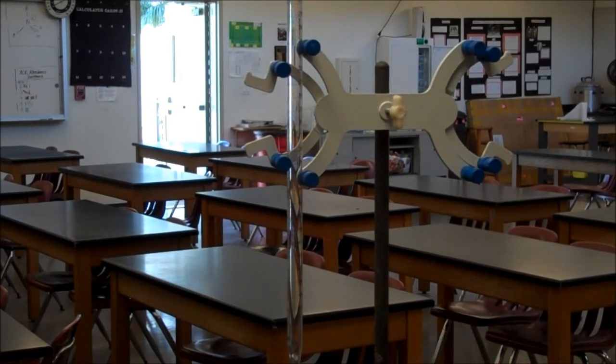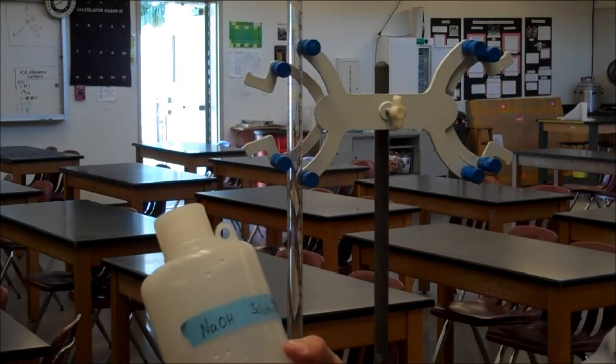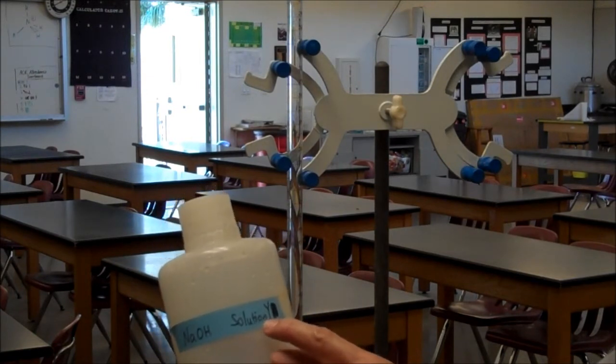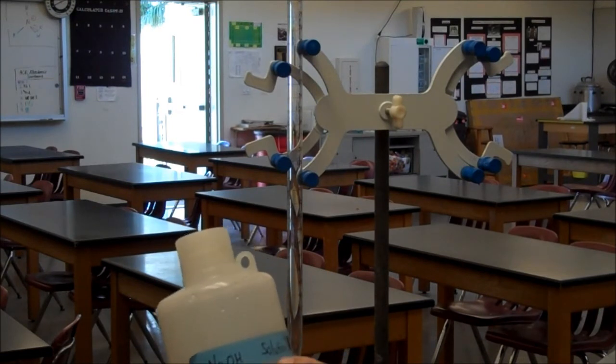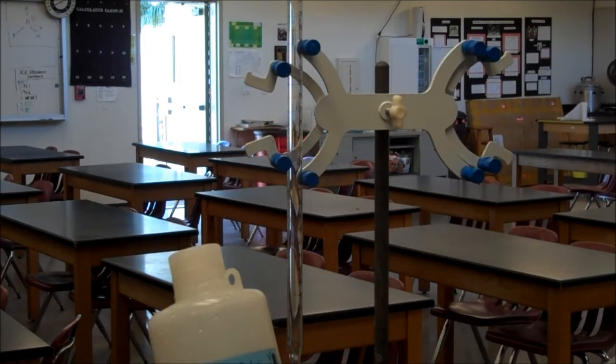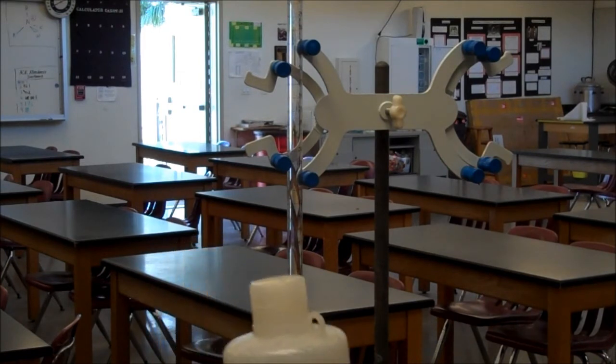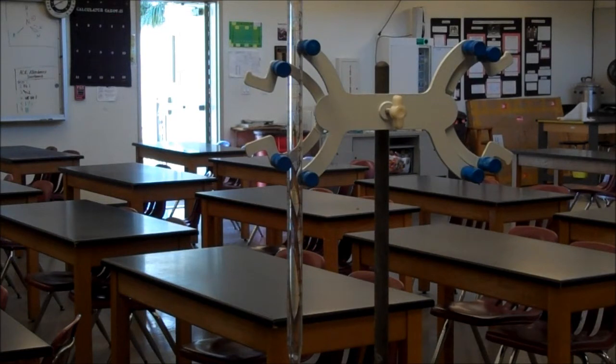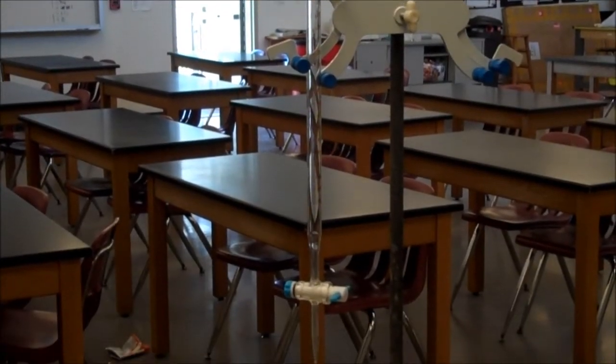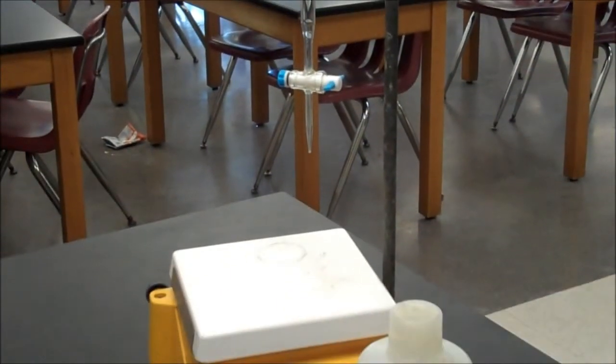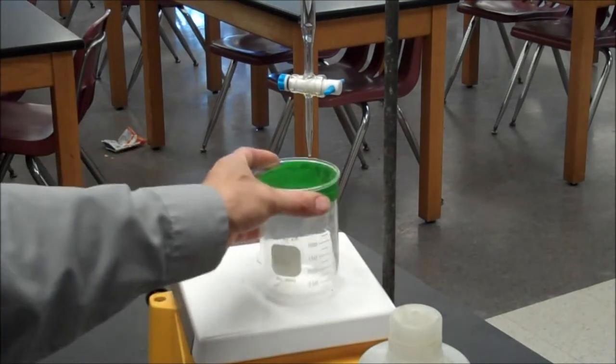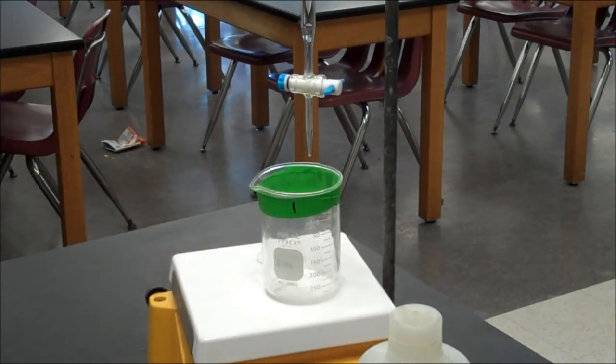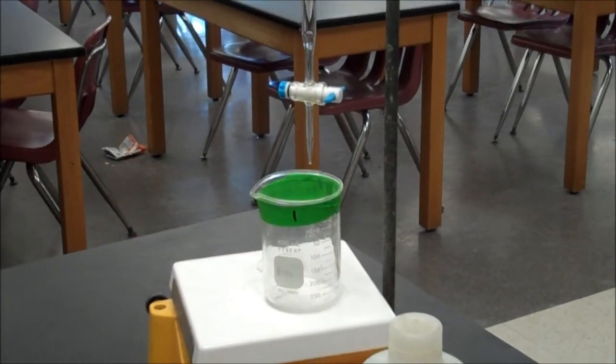I'm now going to load the burette with some base. You're going to have a solution, either solution X, Y, or Z. It's sodium hydroxide, so it's a strong base solution, but you won't know the concentration. I made them all different. To fill the burette is tricky. One of the precautions I ask you to take is that at the bottom, you want to put a waste beaker, not your precious beaker with the acid solution, just a garbage beaker in case you spill. It's very common that you spill. So there's my waste beaker.